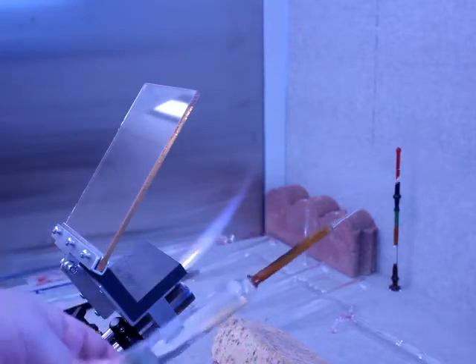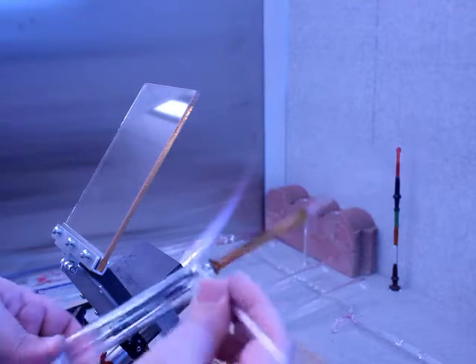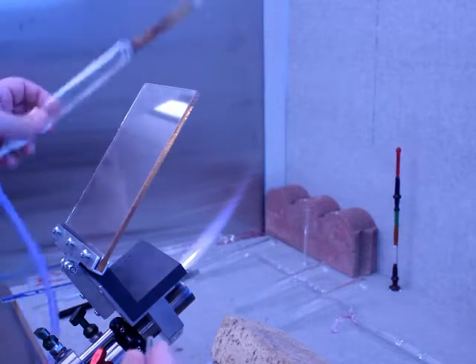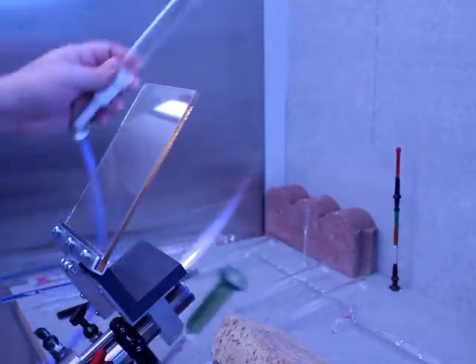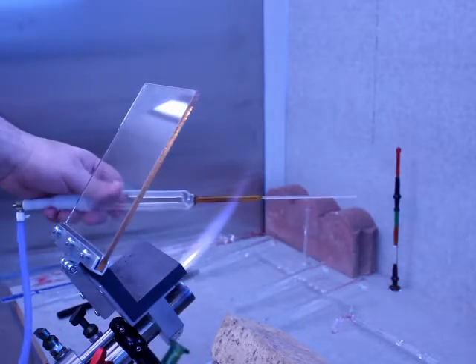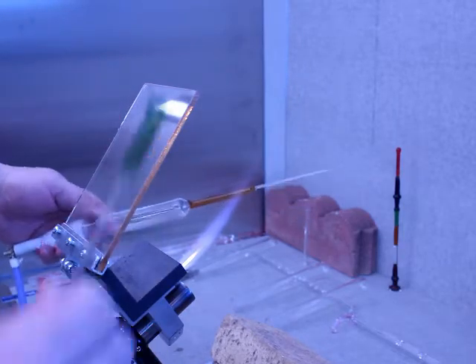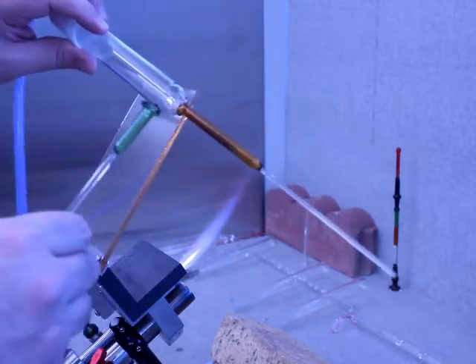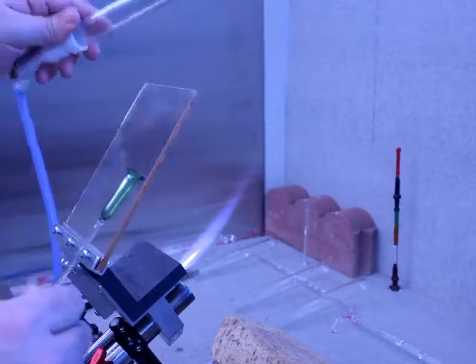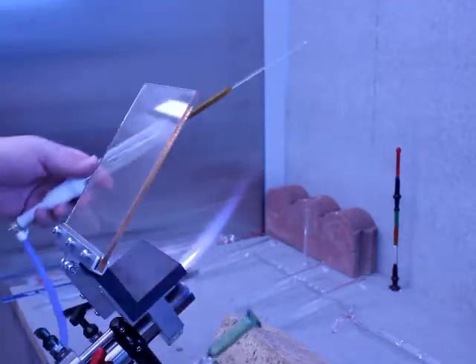So right now this is very lumpy, very bumpy, but it is a good seal. I can blow into it and there's no leaks. So that's the important part, and then I can come back later with the hand torch to clean it all up. Again, the reason I don't want to mess with it right now, if you look at this, it's actually not so bad. It's pretty straight and relatively speaking uniform. If I try and heat this up to clean this up right now without a bridge, this is going to move on me, and it'll make a mistake. It'll basically make a small mistake into a catastrophe.